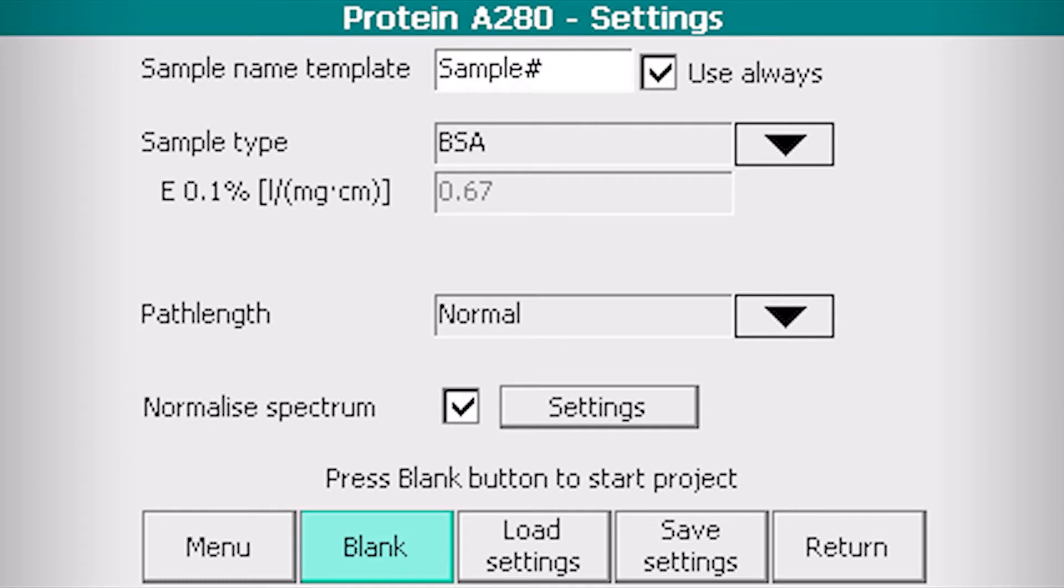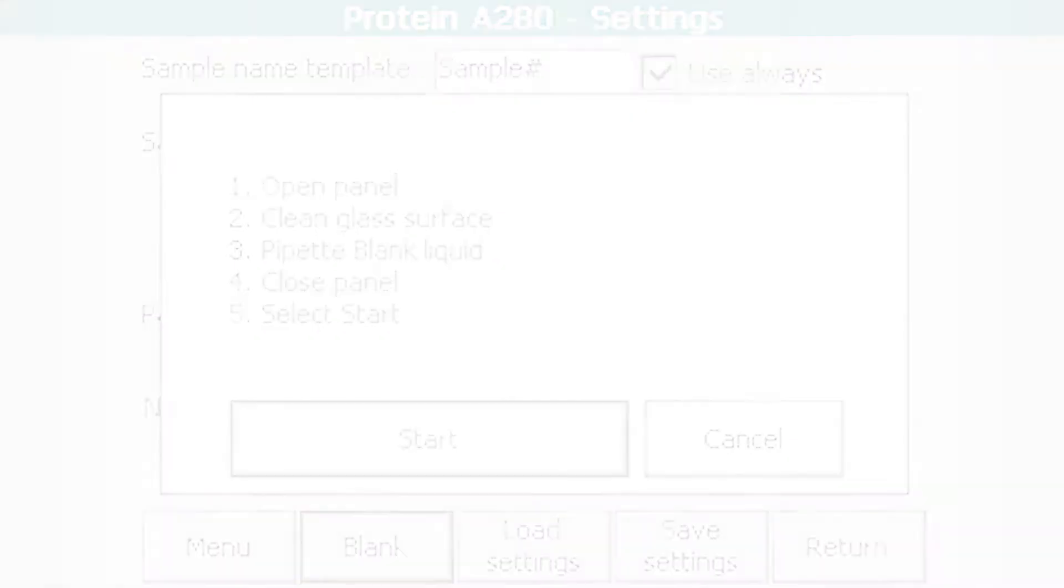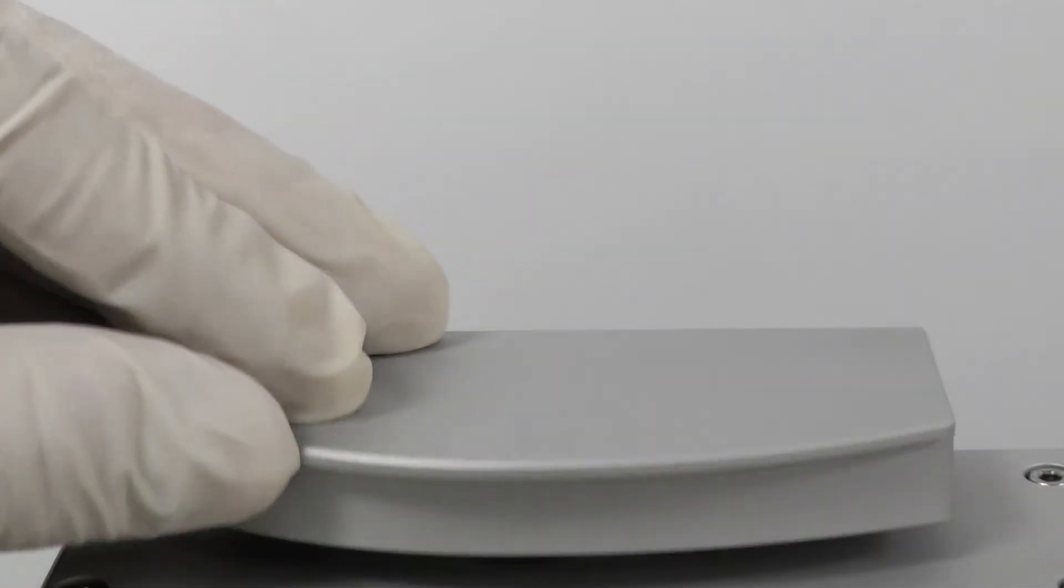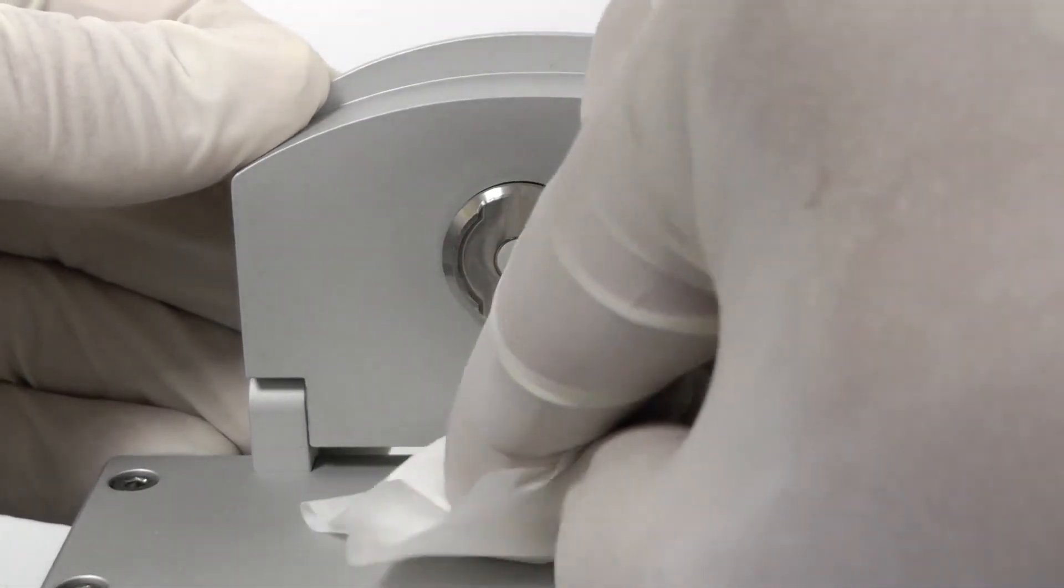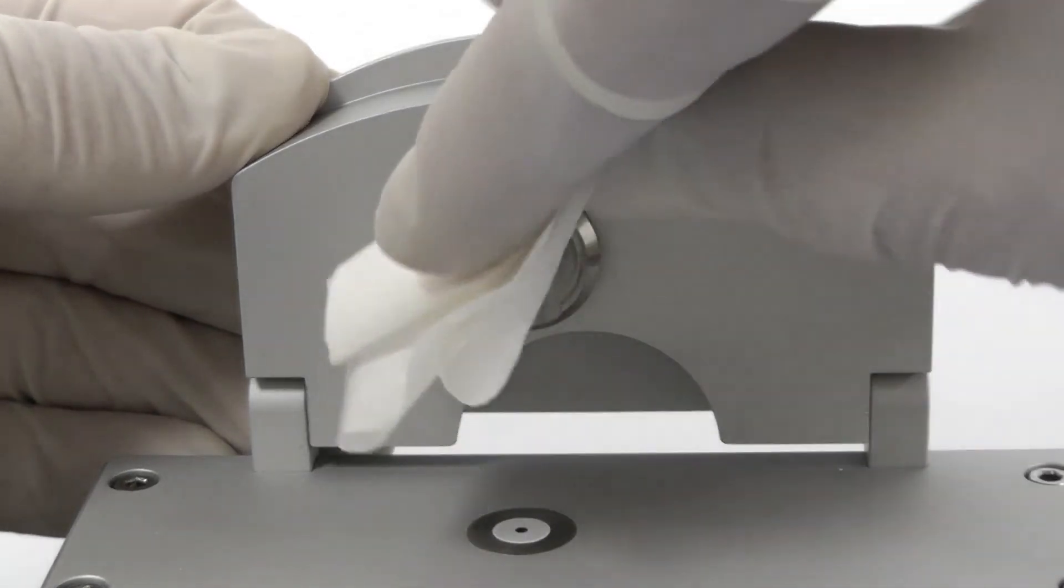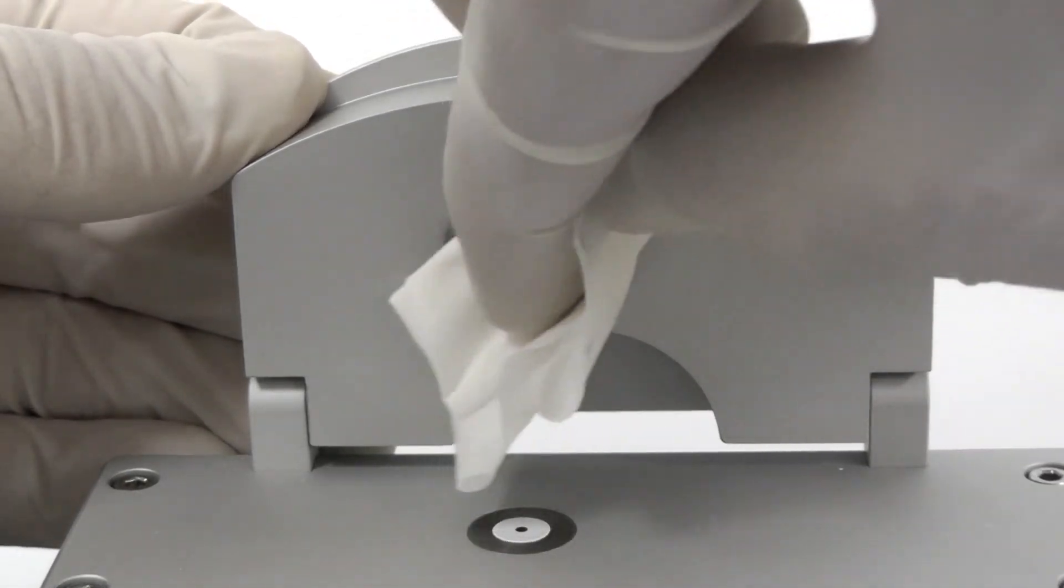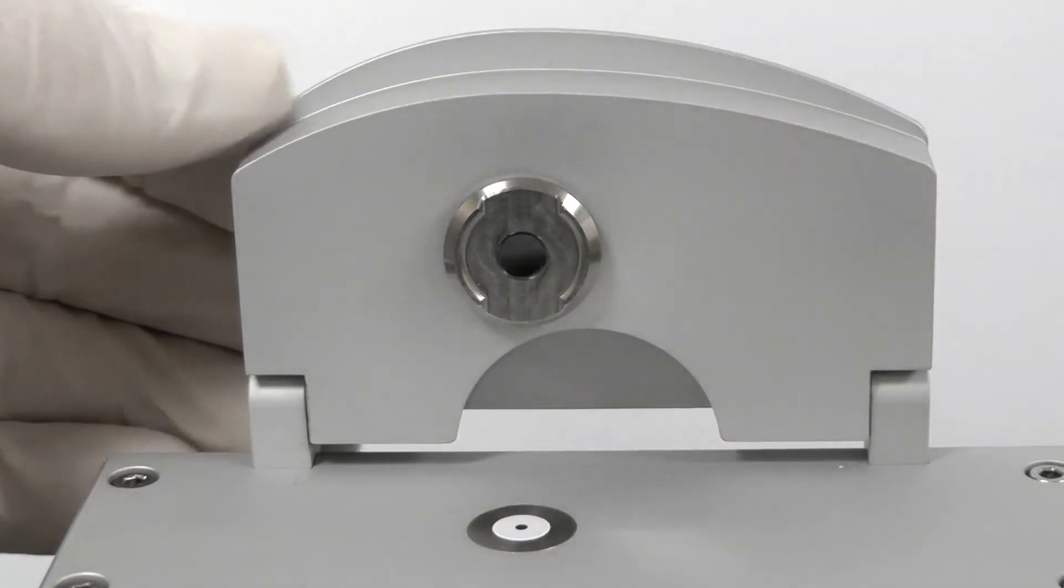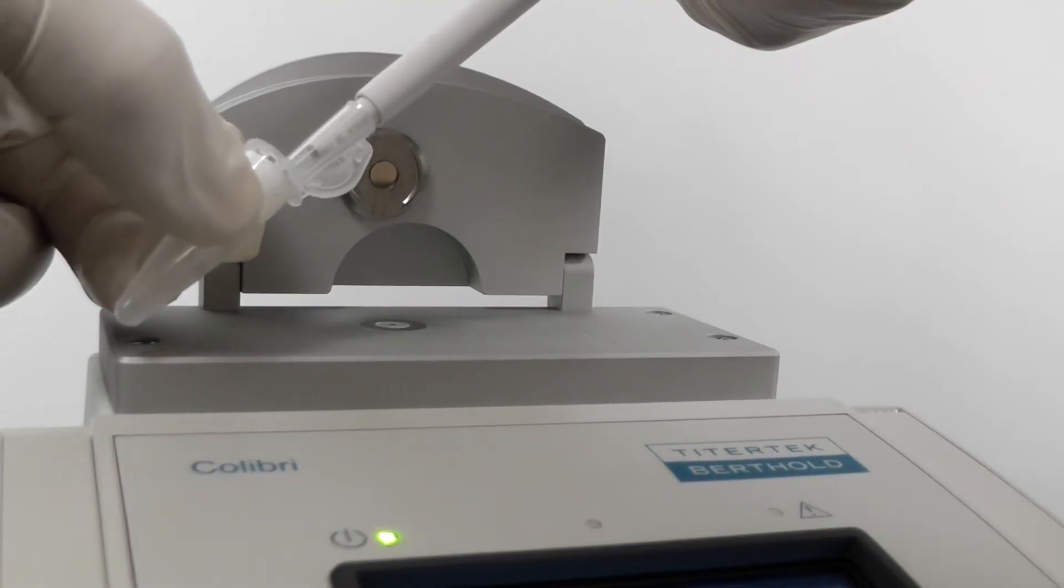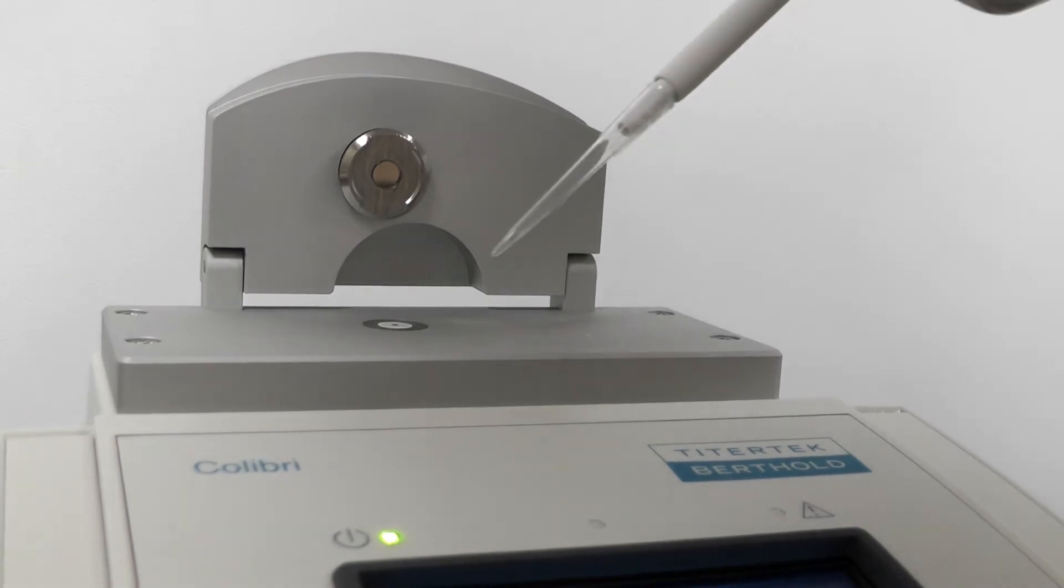Click the blank button. Open the panel. Clean upper and lower glass surfaces carefully using lint-free laboratory wipe. Pipet a drop of buffer and close the panel.